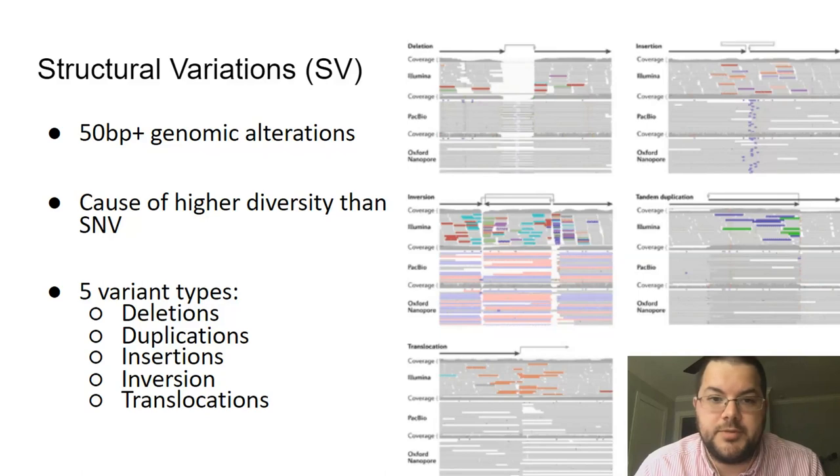Here I'm just showing you a structural variant map across the SKBR3 breast cancer cell line, where you have multiple connections between different parts of the chromosomes, indicating important and less important genomic alterations of this breast cancer cell line that lead to this tumor progression. But they also play an important role in other diseases besides cancer, for example, in Mendelian diseases, where we often look at deletions and duplications de novo to a certain patient, or in more complex diseases like adult diseases and cardiovascular diseases or disease risks, as well as neurological diseases.